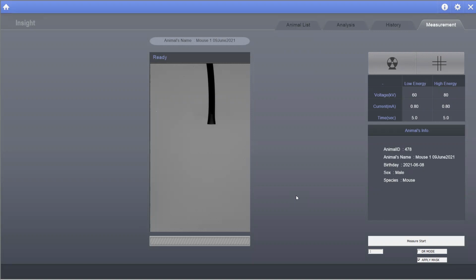So another question on can you measure the area and the size of the pancreas of the mouse? I'm going to follow up separately with you on that one, Hui, just because I'm not sure that the organ is going to show up well enough on the X-ray to be able to see it, but there's other ways that we can do that with a different system other than the DEXA system.